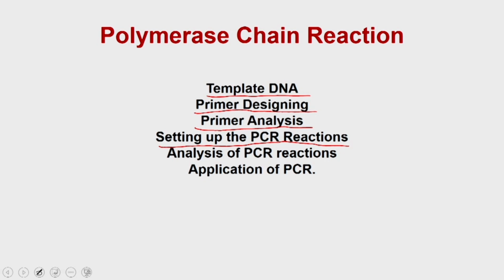At the end we will show you how to set up the PCR reactions, how to add the individual components, and what precautions you should take while setting up the PCR reactions. We will take you to our lab and show you how to set up these reactions, and how to set up the different steps within the thermal cyclers, along with a demo of preparing and setting up the PCR reactions.